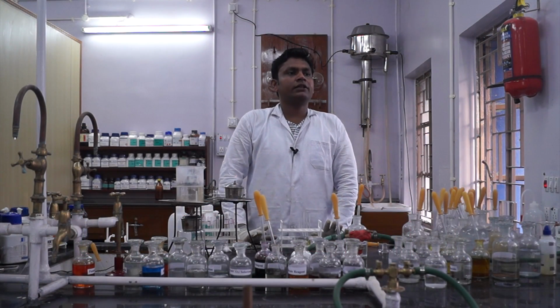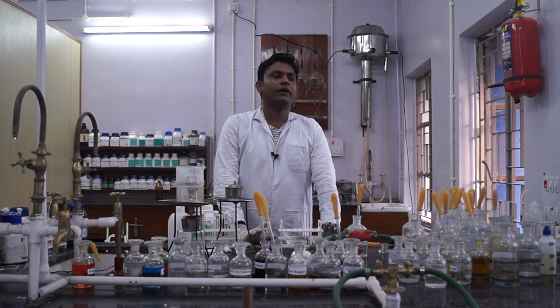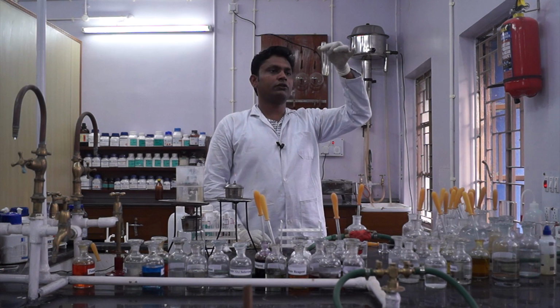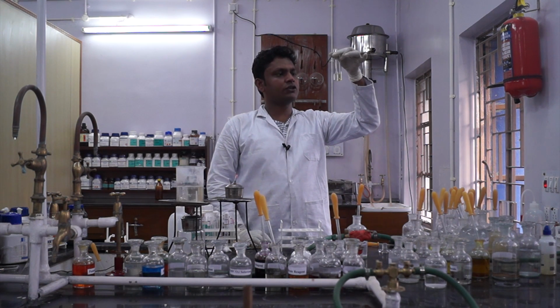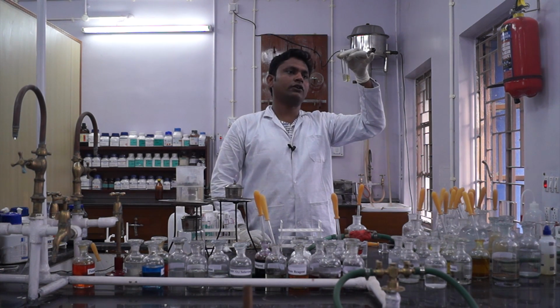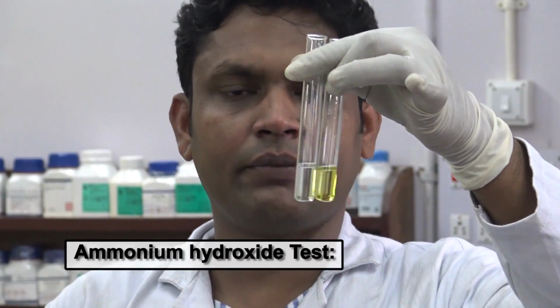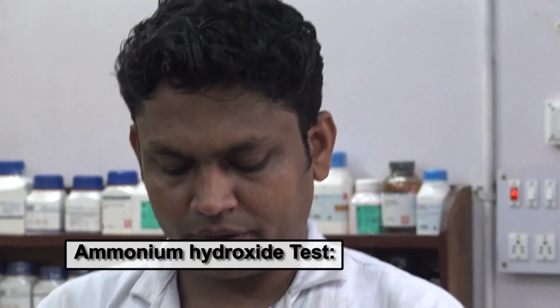Now we will do the confirmatory test of ferric or ferrous ion. Here I have taken two test solutions, one of which contains ferrous ion and one of which contains ferric ion. Let's see with the ammonium hydroxide test what happens. We can distinguish between these two, which is ferrous and which is ferric ion.